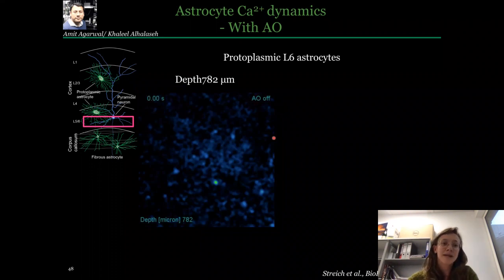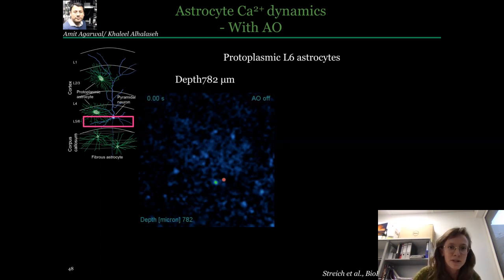And here, as a reminder, we're doing aberration correction on functionally fluctuating structures. Aberration correction is performed on the somata, and the calcium transient of the somata is on average around 8 seconds long. So we are an order of magnitude faster to correct than an independent mode where the signal has to be constant.